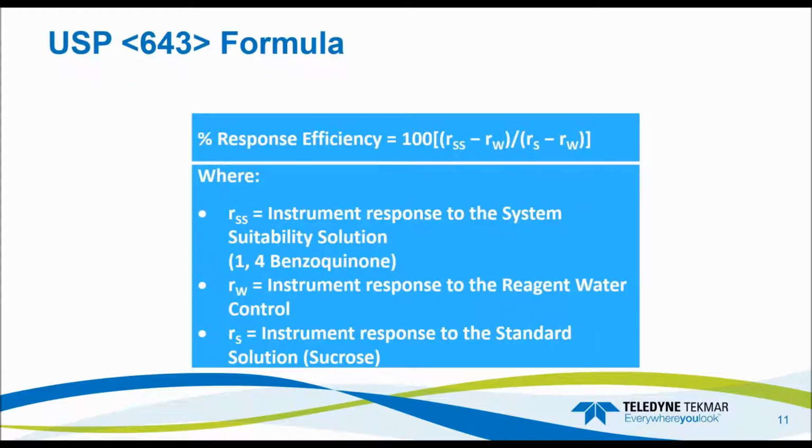All right, and here's the formula given in USP 643. It's 100 times, which makes it a percent, your 1,4-benzoquinone minus the reagent water response, ratio to your sucrose response minus your reagent water response. And it looks kind of complicated, but when you slice it down, it's pretty easy.